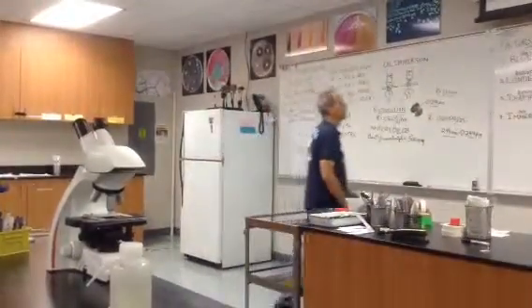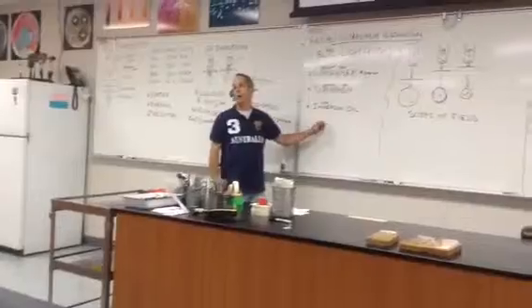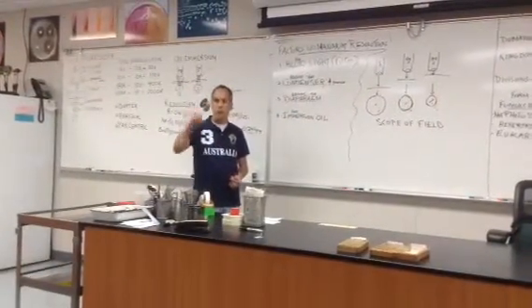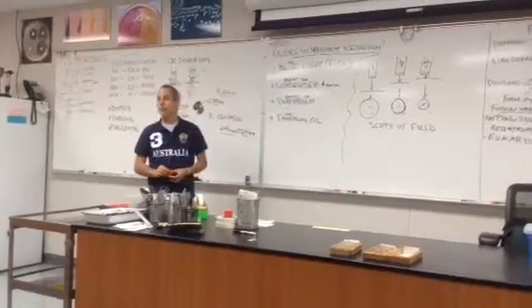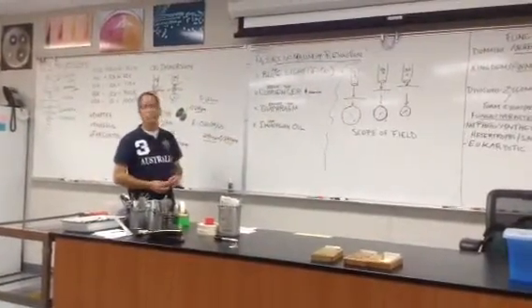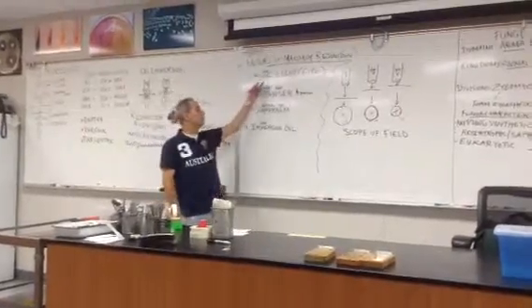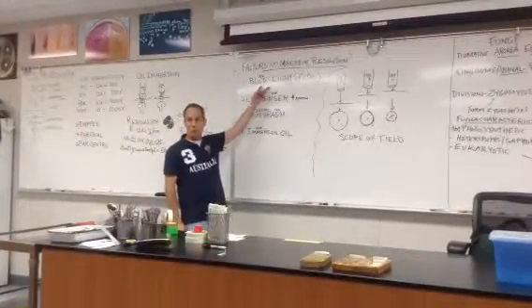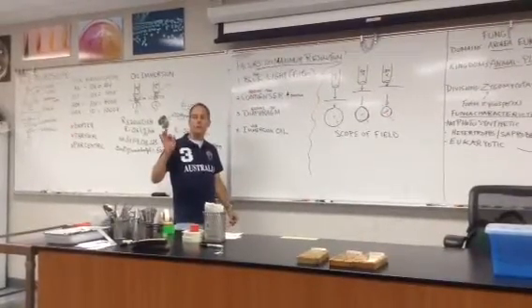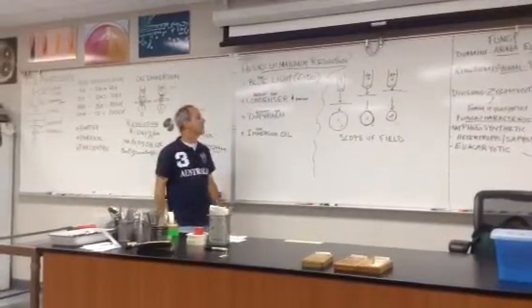This answers one of the questions on my exam right here. What are 4 things we can do to the microscope to get the best resolution possible? These are the 4 things. We could potentially use a blue light or a blue filter. We're not going to do that in this class because we don't have the need to do that.